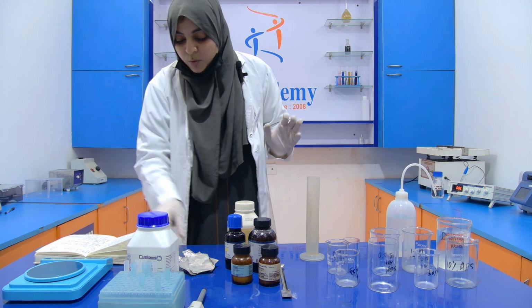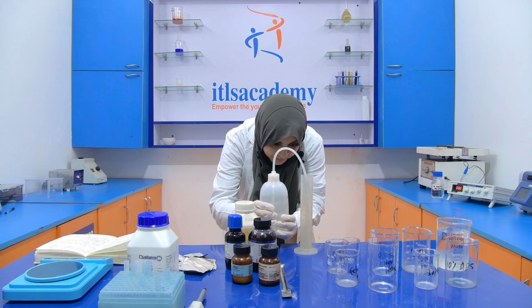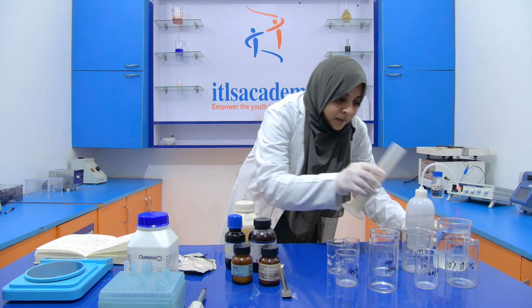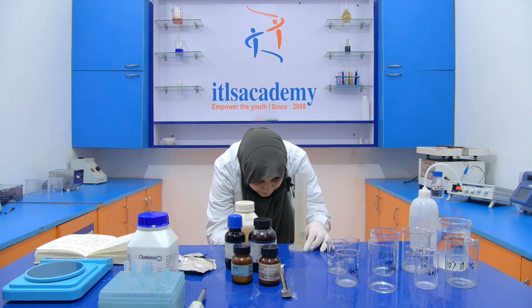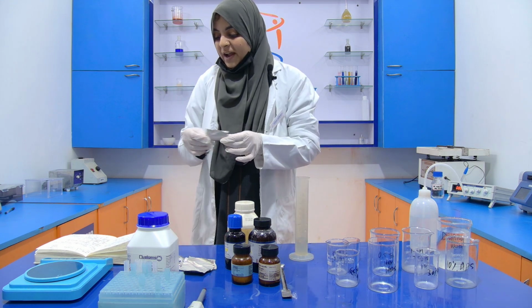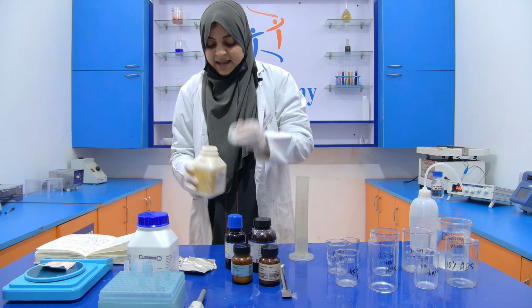Now I am going to weigh 25 ml of distilled water. This is 25 ml of distilled water. Now I am going to weigh 5 grams of this SDS. The first chemical that we are going to prepare is SDS.